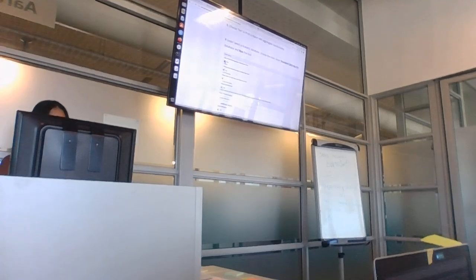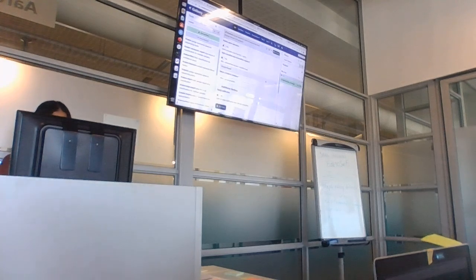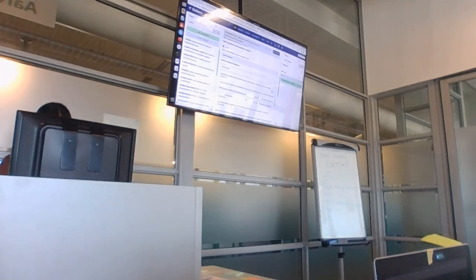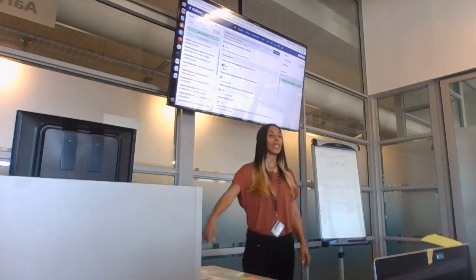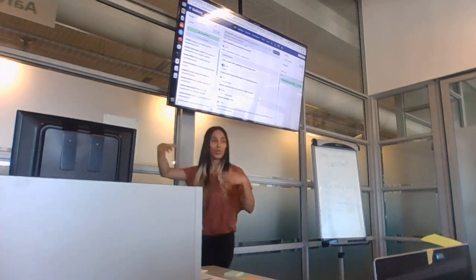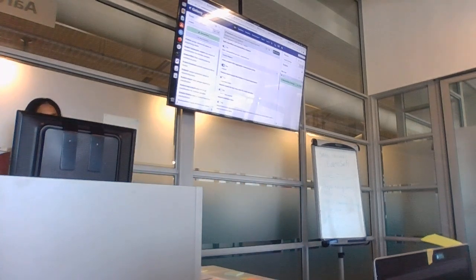And this is important, you want to print the aggregate of the counts. And you have to select the database. I normally take the most recent standard one. I think it was 20. So this one, 2021. And like I said, under create report, change this to yes for aggregate. Do not run the tool. You can do this some other time. I just wanted to show you how to run the Kraken.